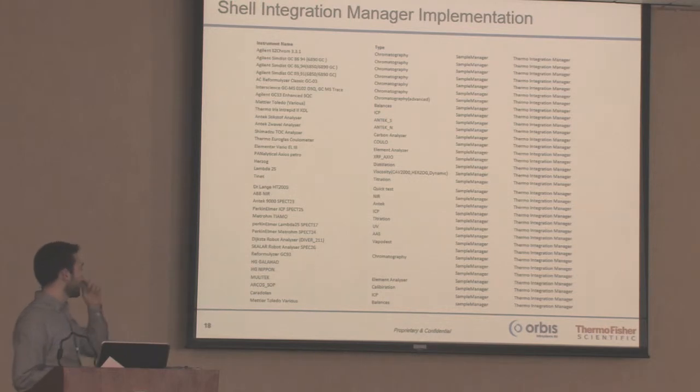So this is an example of some of the instruments that were integrated at Shell, just to give you an idea of the variety. Chromatography systems, analyzers, distillation, feeds. So it's very varied in what we integrate.